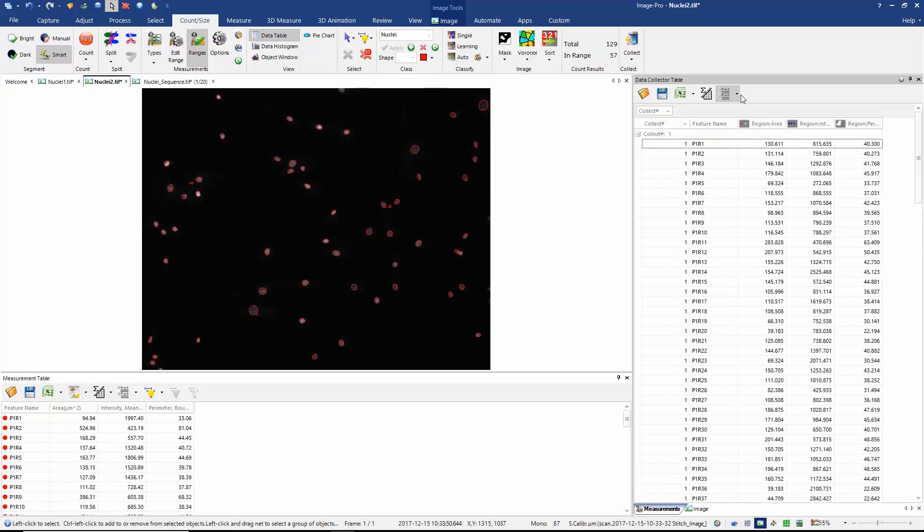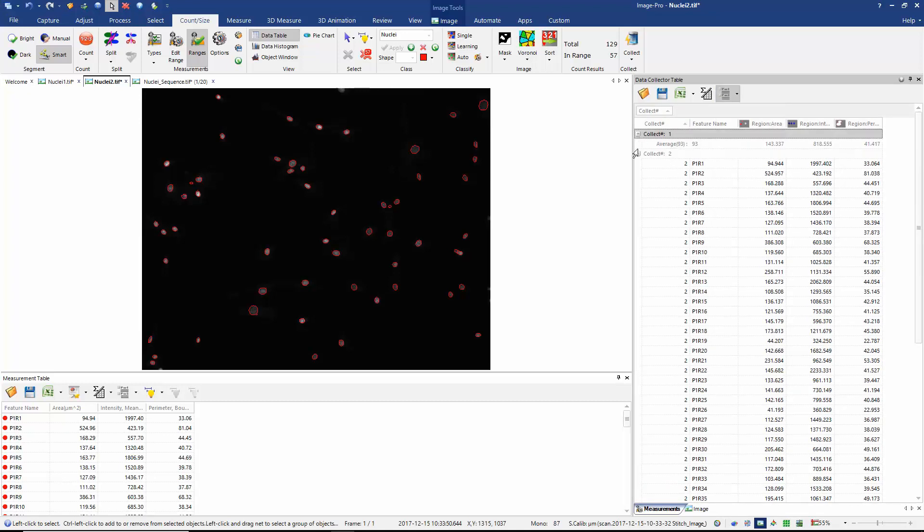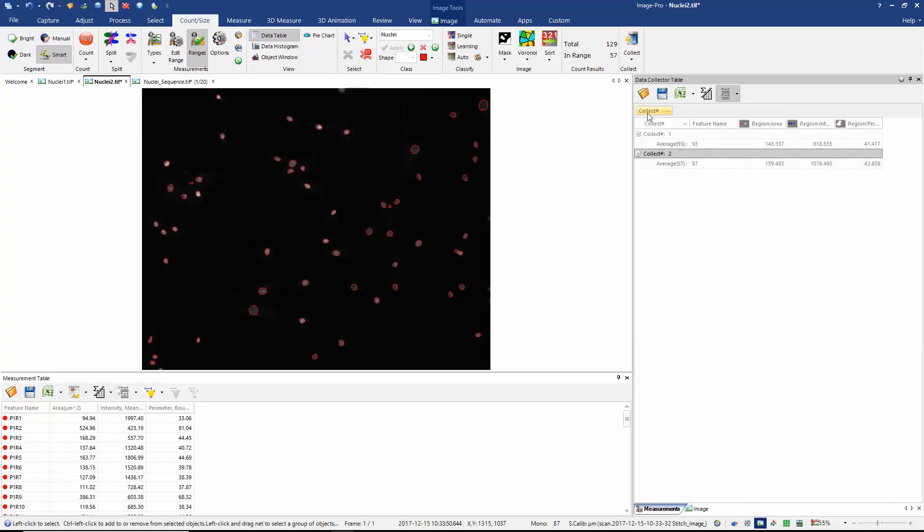If I choose to group and here I'm going to group by average, we can now see that I'm summarizing by collection the average area and intensity from each of my images. So it's a very useful way of comparing data between images.